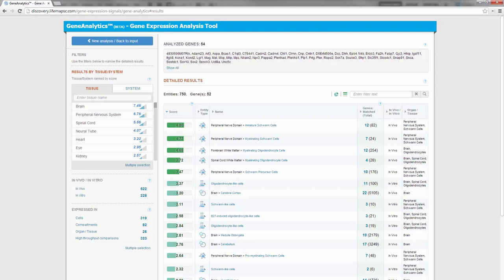Using Gene Analytics, we reveal that the researchers may not have isolated a pure guard papilla cell population. Our analysis suggests that the use of SOX2 as an isolation marker may have led to the generation of a mixed population.